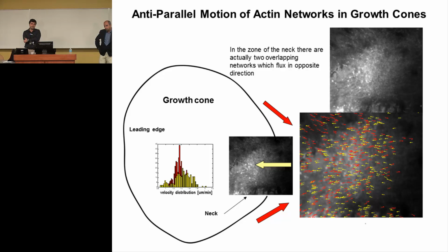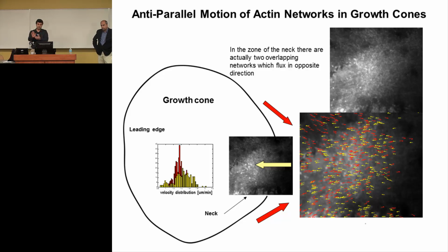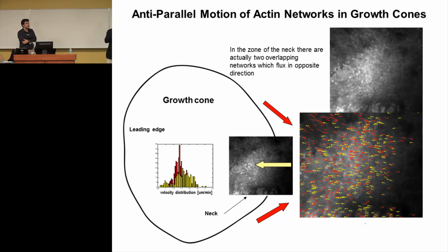But like the sample that you had, the cells were rotating all around. The base was fixed on the needle. So I was analyzing this lateral motion combined with the flux. I mean, you can dissect the different components. Okay, thank you.